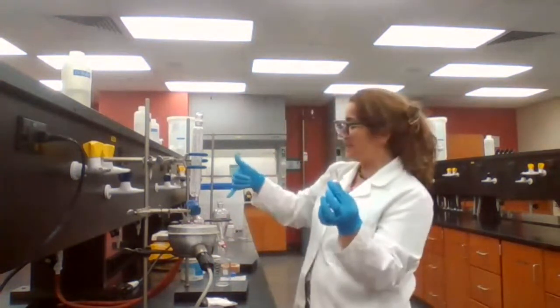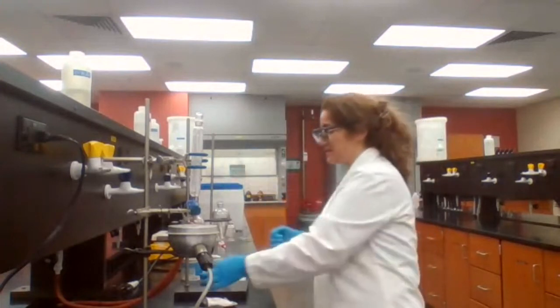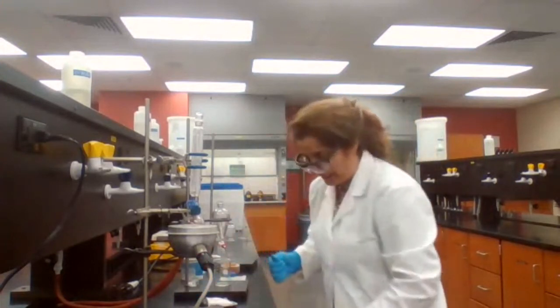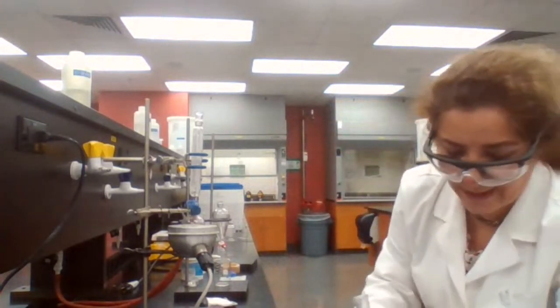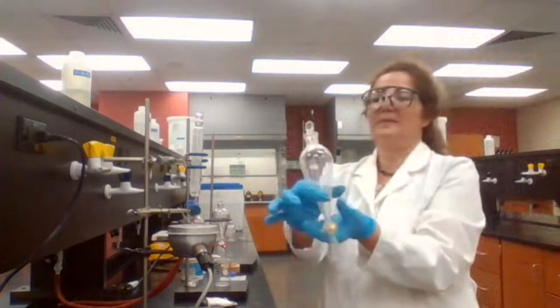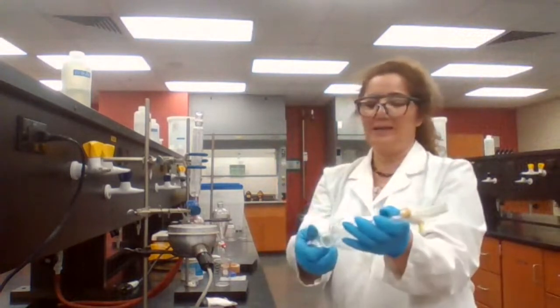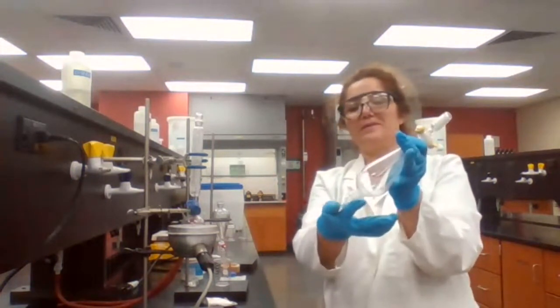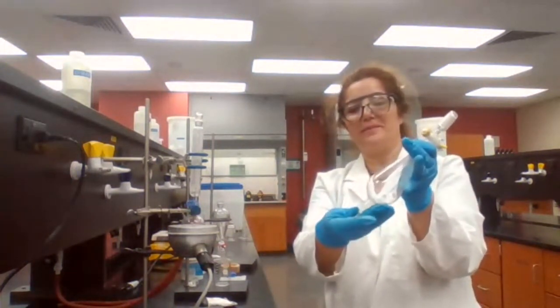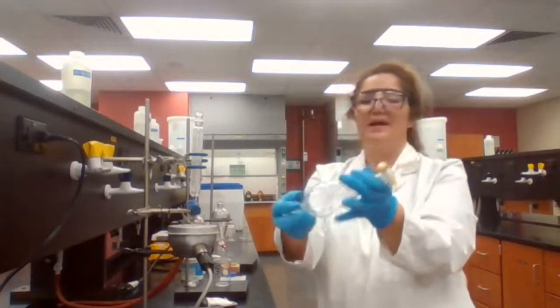And I'm not going to put the cap on, because I have grease and I don't want my chemicals to get greased. So I can use a different one to show you what I mean. If this part is not sealed, when you are shaking, see how loose it is, it can come out. If it comes out empty, it's okay, but if you have the chemicals, as soon as it comes out, then you get all the chemicals in your hand.